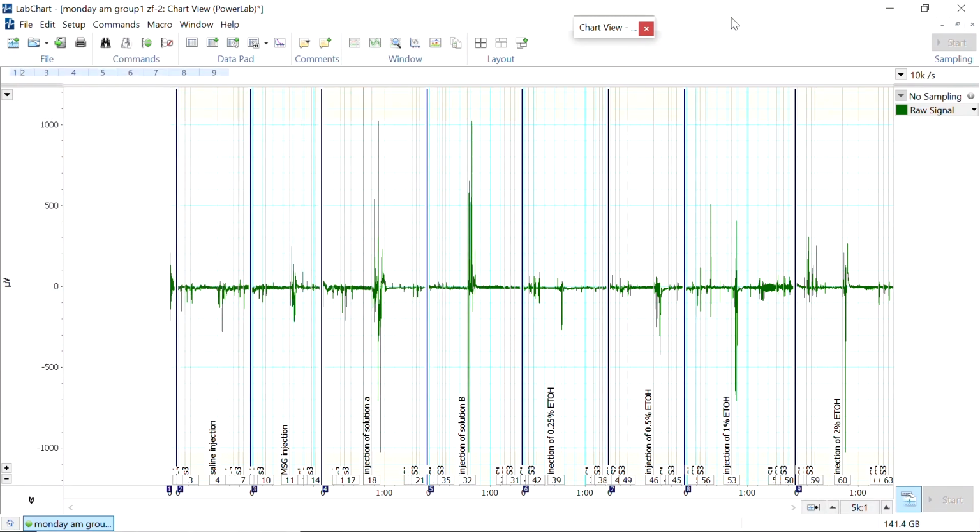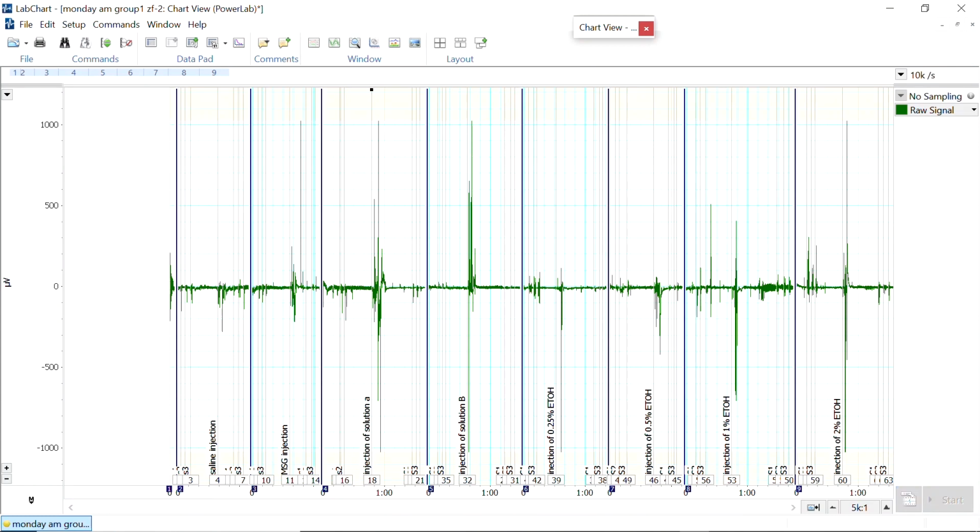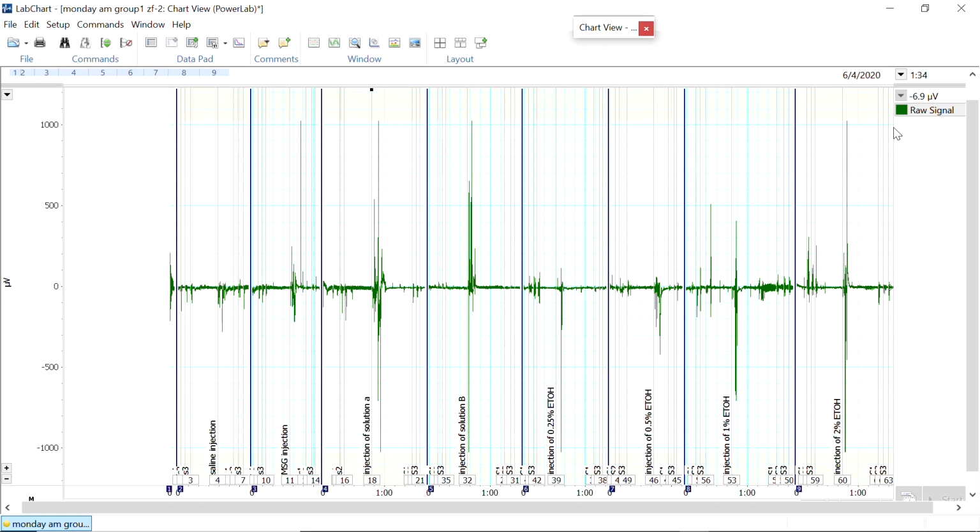Okay, now I'm going to show you how I'm going to rearrange my interface so it's going to be more user-friendly. So first one, I want to make this panel smaller. I can just click this shrink thing. Okay, it doesn't change anything.